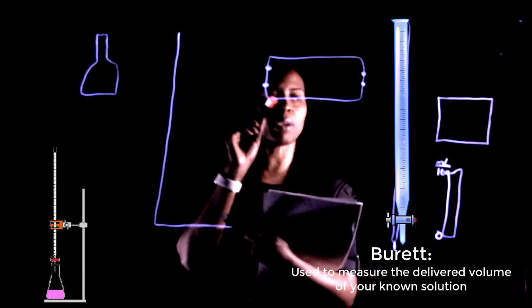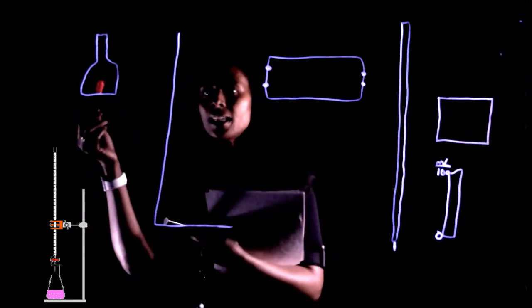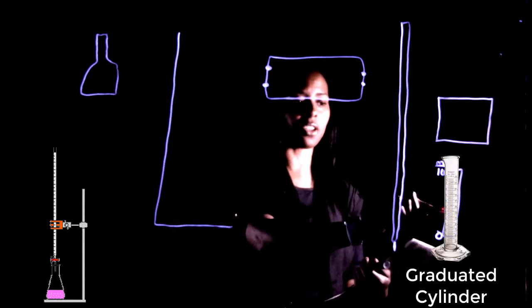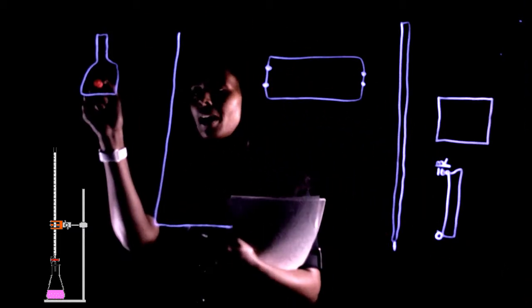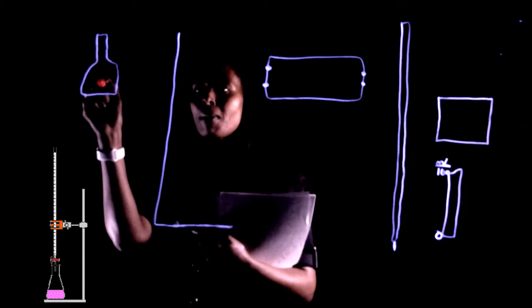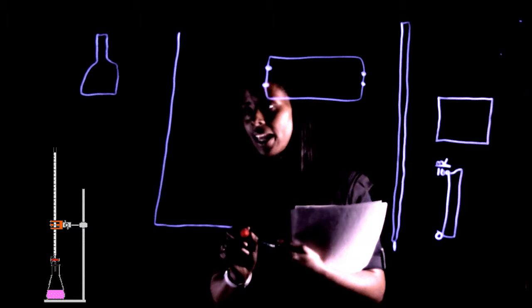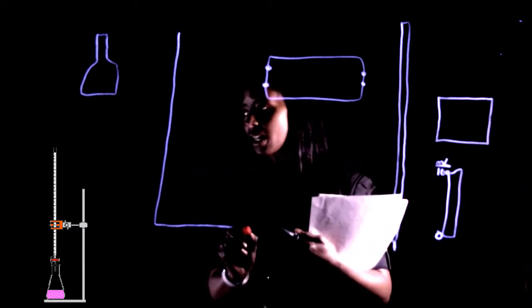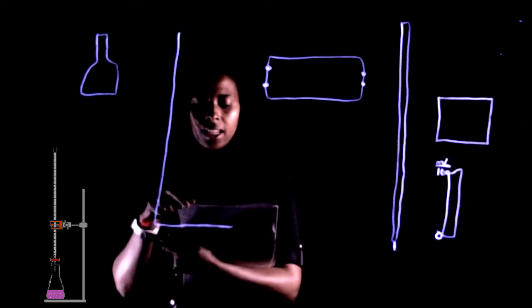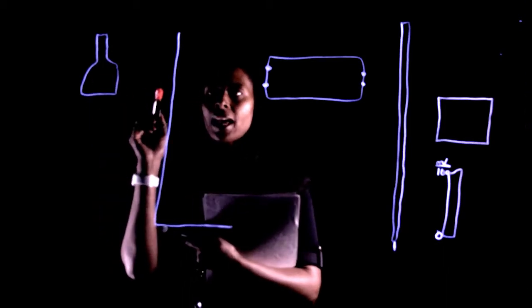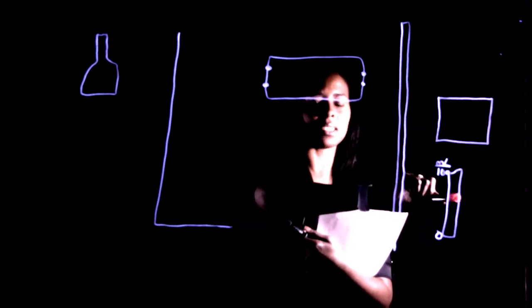Once you have your solid measured out on the balance and placed into the Erlenmeyer Flask, you have to mix it because it needs to be a solution. You'll use a graduated cylinder to measure out a certain amount of distilled water and mix it in the Erlenmeyer Flask. The flask sits underneath the ring stand so that the burette solution drips down into it and the reaction proceeds. Key apparatus: Erlenmeyer Flask, ring stand, burette clamp, burette, analytical balance, and graduated cylinder.